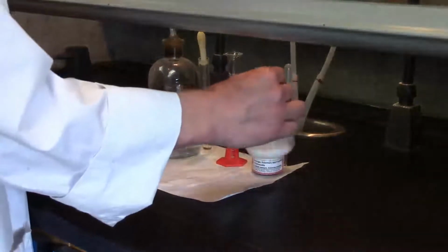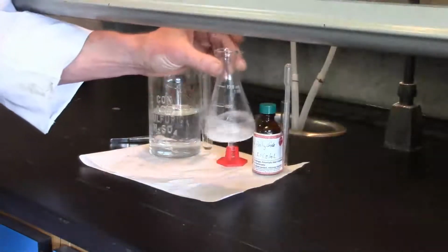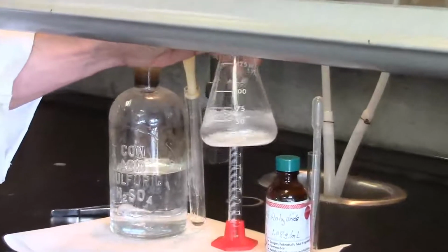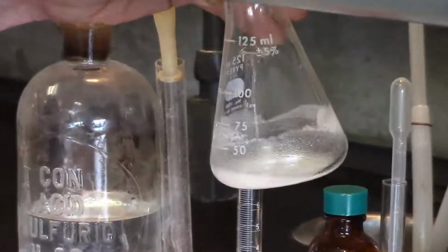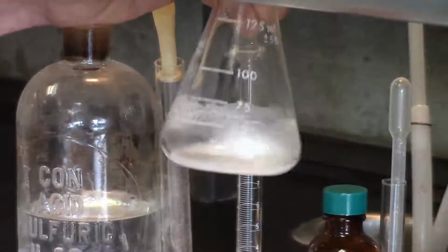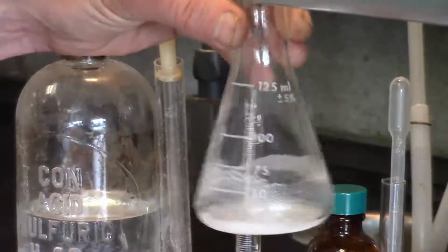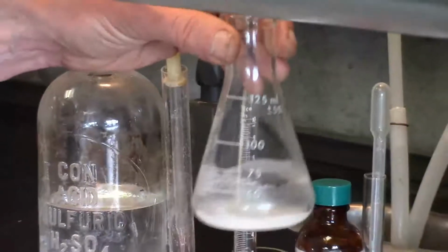Now I'm going to swirl, and you'll see that I still have a milky consistency, but the color has changed a little bit. Now I've done this experiment a number of times. Sometimes at this stage I actually see even a pinkish color. Right now it's kind of yellowish. So what you see exactly will depend on your particular experiment, but it'll range somewhere between a slight yellow to a little bit of a pinkish color.